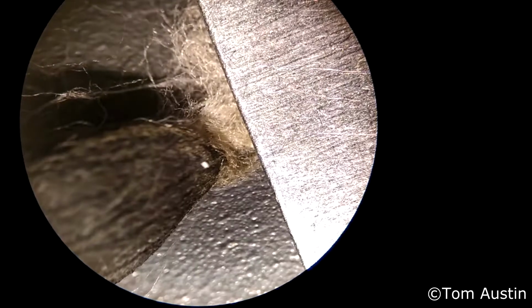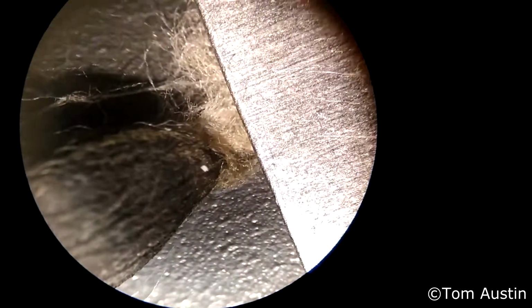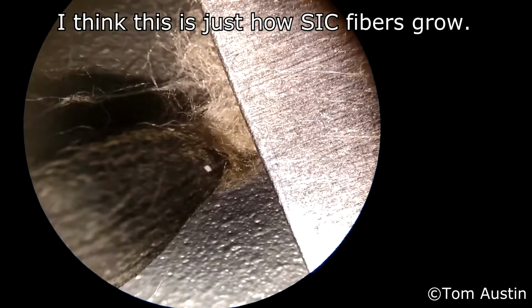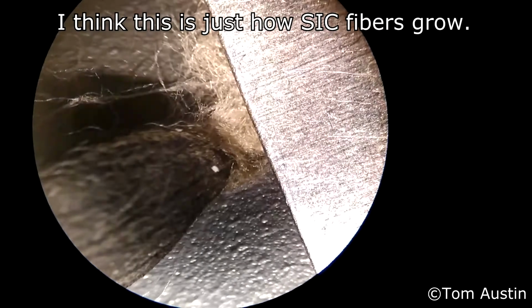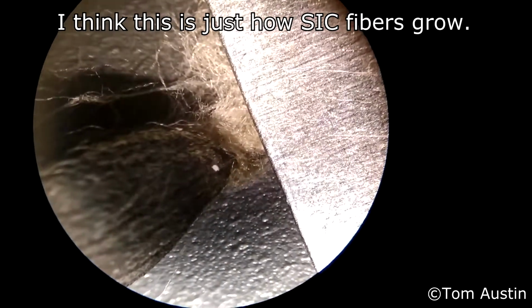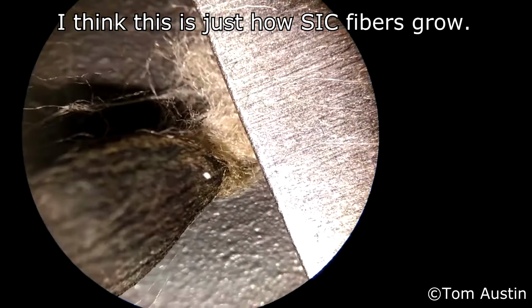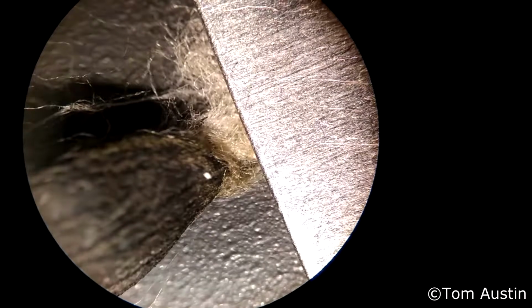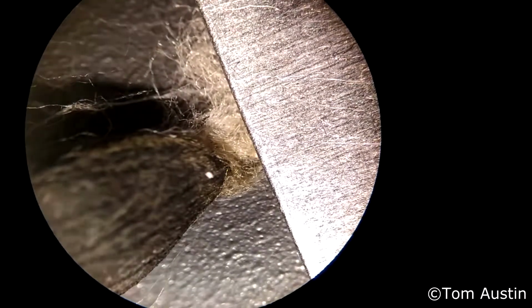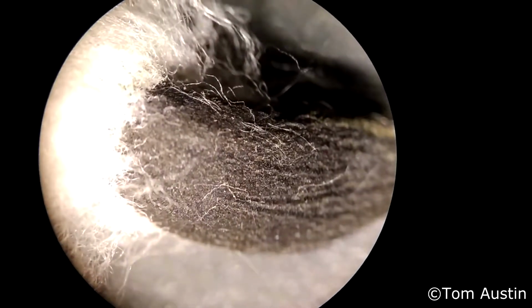One thing I am noting is that there's basically no usable lint coming out of the top of the seed coat, which is worrying to me. This may just be something to do with these underdeveloped bolls, or maybe just this one plant in particular, but that is something to note. That's definitely why the bolls seem to be not as full as I'd expect. Also, sorry about the camera work. I'm just sort of free holding this thing above the dissecting scope eyepiece, so it's going to be a bit rough. Here's the seed coat itself.